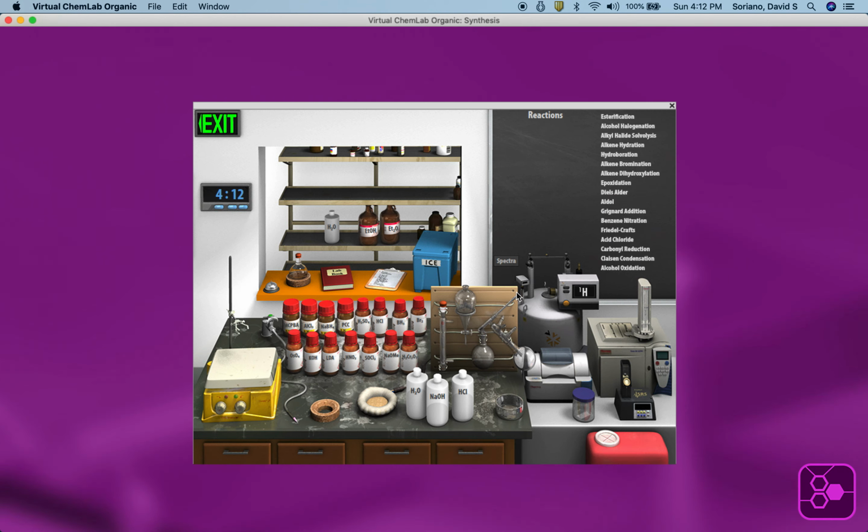Okay, this will load in a minute, and we're going to go to the Diels-Alder on the right there. And like I did the last time, we're going to take the quinone, 2,5-cyclohexadiene-1,4-dione. You can, in principle, do a double Diels-Alder here. This is your dienophile. But we're going to look at the mono-adduct, which can be done. So we're going to react one side of the compound, but not the other. So I'm going to add that. See, it's a solid, the starting material.